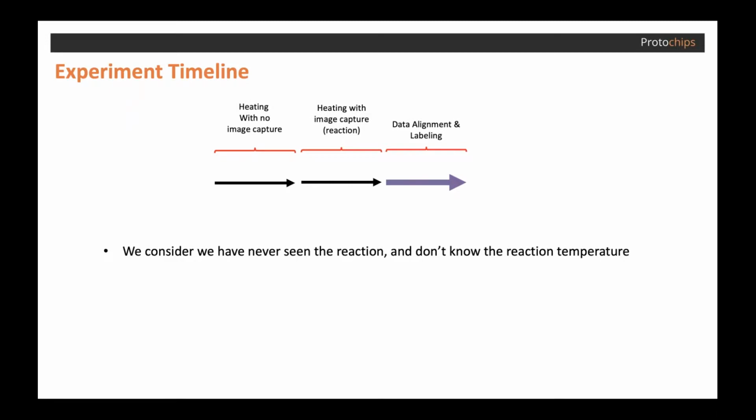In order for this comparison to be valid, we need to run the pre-AXON simulation in such a way that illustrates what a researcher might do in order to generate the best data we suspect is possible. Now, since we're still under the assumption that we've never before run this experiment and had never seen this sample react before, we can't technically yet know at which temperature things would start to change or how aggressively we could ramp the temperature.